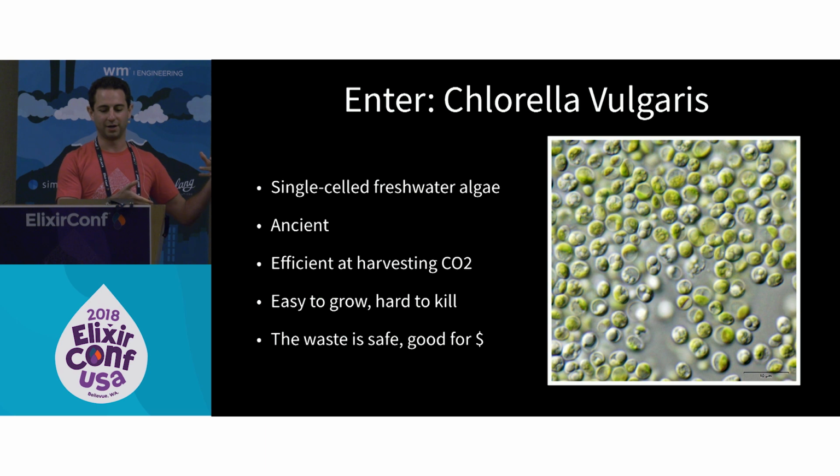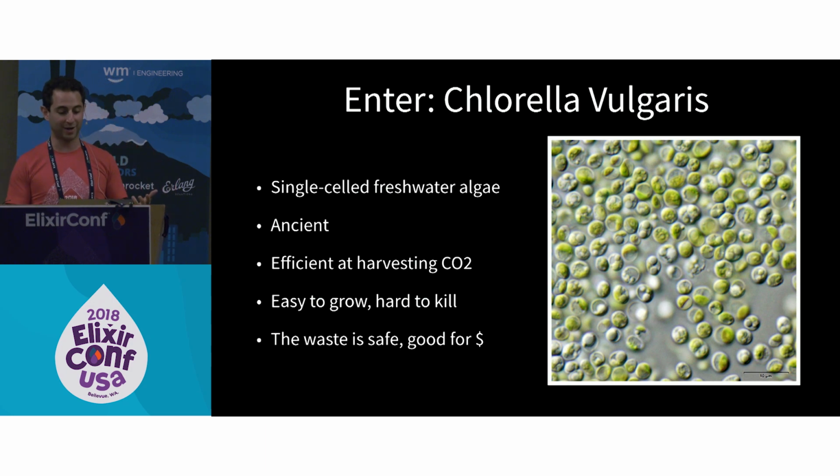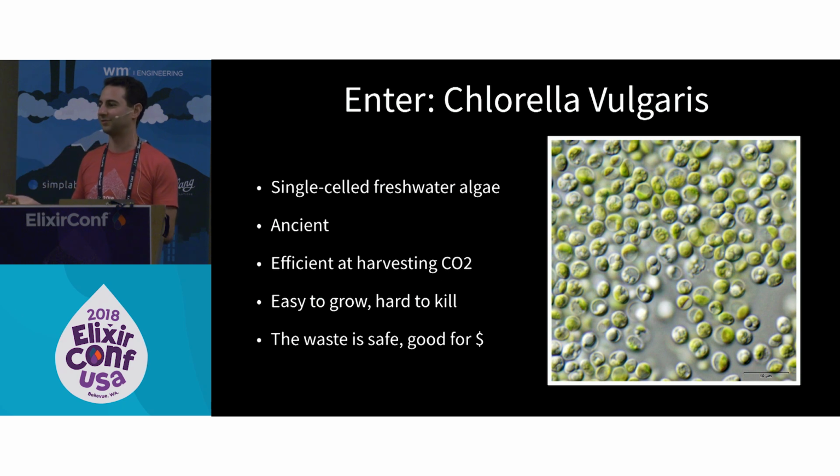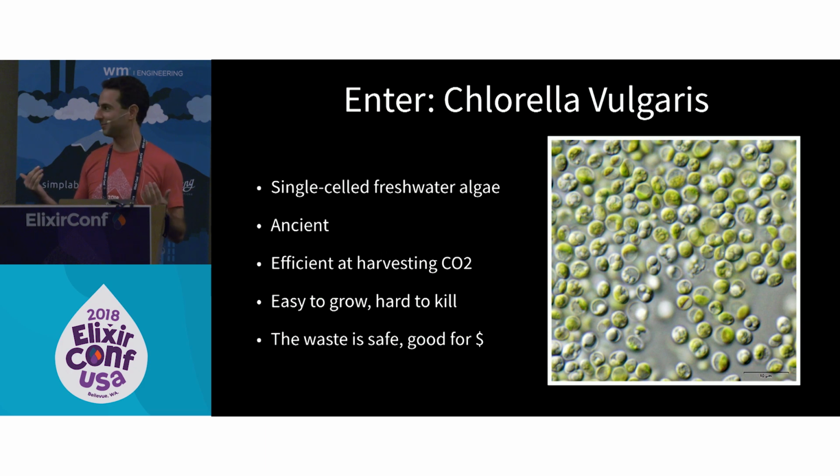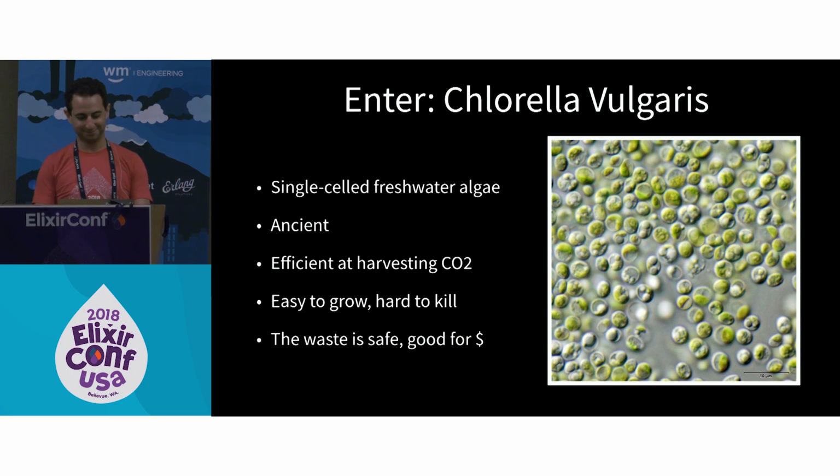So it's easy to grow, it's hard to kill, and if you are growing it in a tank with water, every once in a while you will need to throw out that water or do something with it. The waste is safe, so we're not creating trash from this experiment. And as I later read, the waste can actually make you money. Globally, the industry for growing algae like this and selling it for things like animal protein, for fertilizers, for all kinds of products, it's like a $5 billion industry. So maybe there's even an opportunity with this project to make money on the side. I don't know if it's possible.